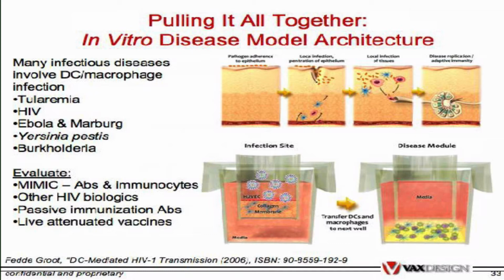We can test the product of the LTE or the PTE modules in a functional assay and determine if these antibodies or T cells are functional.